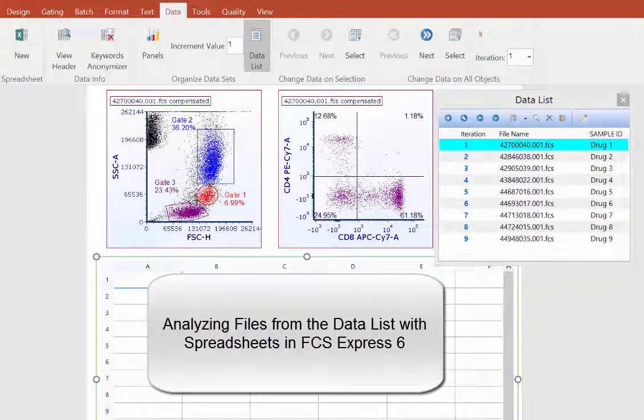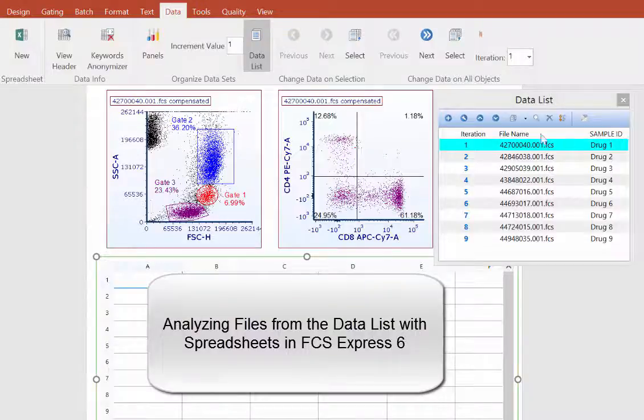Spreadsheets may be used to quickly analyze and compare statistics for many data files in the data list without opening additional plots or creating a batch process.